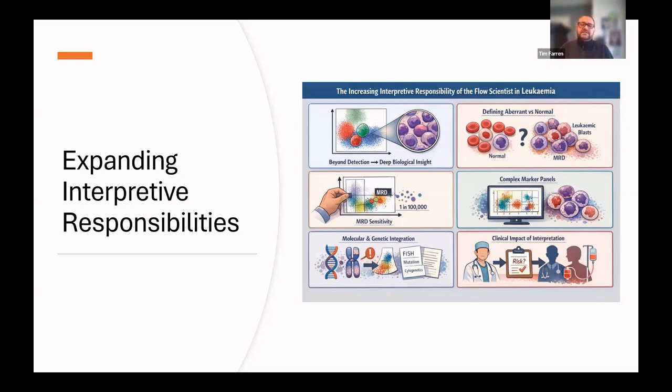It will rely on things such as marker selection and, of course, experience, especially as we know that a lot of modern therapies, particularly in clinical trial settings, can shift antigen expression. And it really does challenge established detection strategies. So as scientists, we have to continually adapt and shift to these therapeutic advances to ensure that we're capturing the accurate disease assessment.